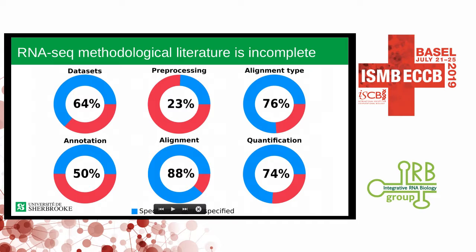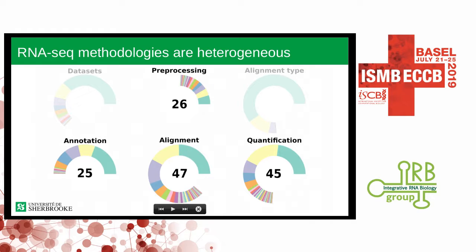and we should do something about it. We also have to keep in mind that RNA-seq methodologies are quite heterogeneous. There's a wide number of different tools and references that can be used for each of the different steps. In every step, the vast majority can be explained by only a handful of tools, but they still have a long tail of different software that is being used and that might induce some biases in the literature.